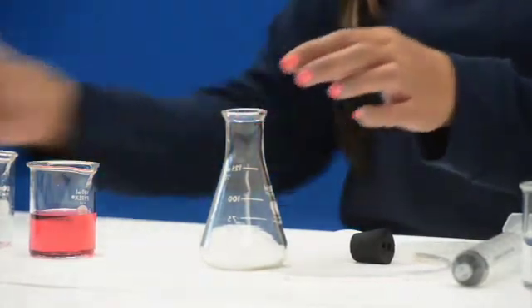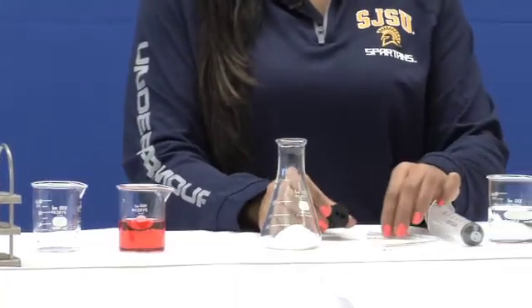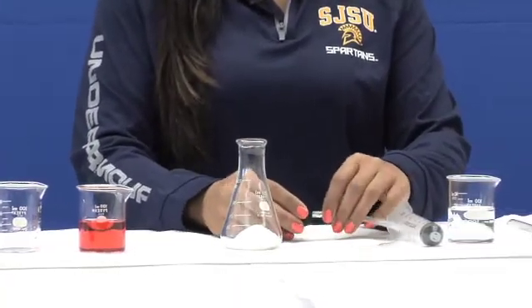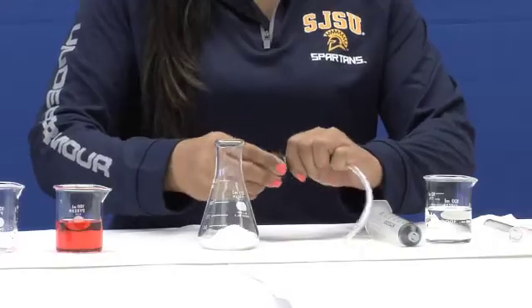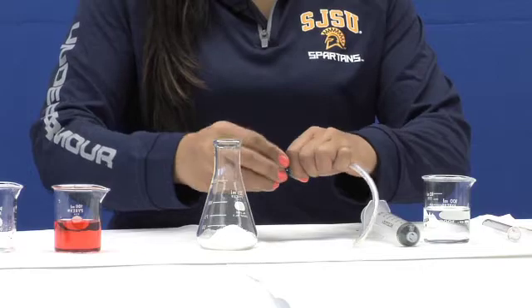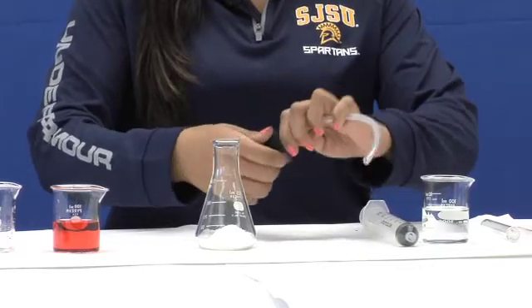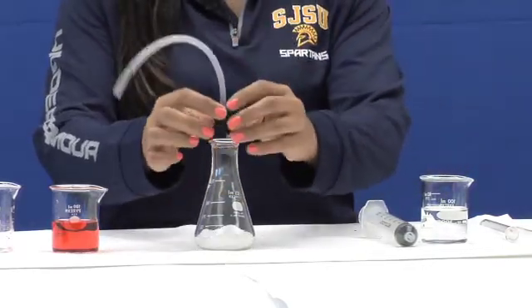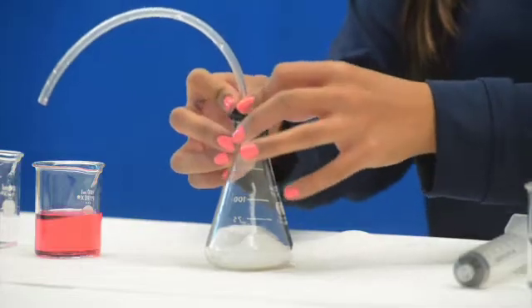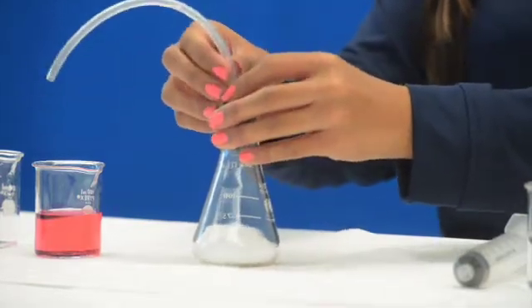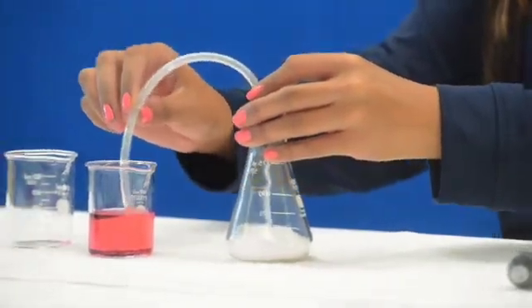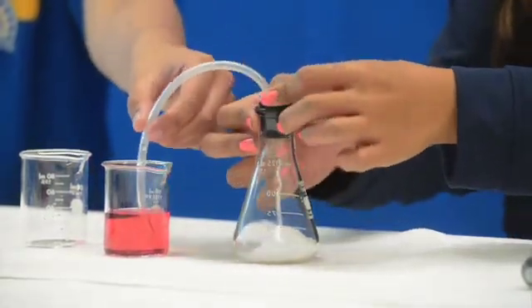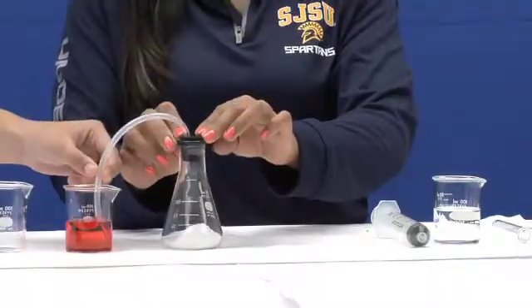Then, take your stopper, which has two holes, and place your plastic tubing in the larger hole. Secure the rubber stopper with the plastic tubing into your flask and completely submerge the other end of the plastic tube into your beaker and have a partner hold it.